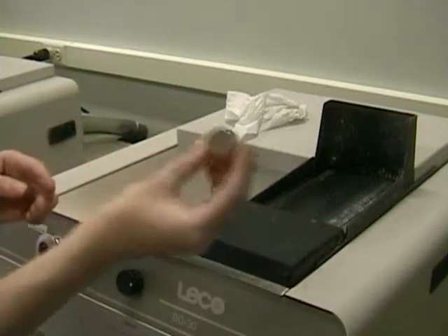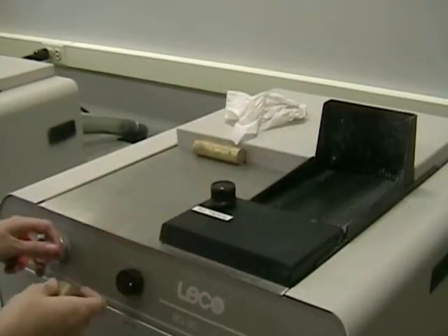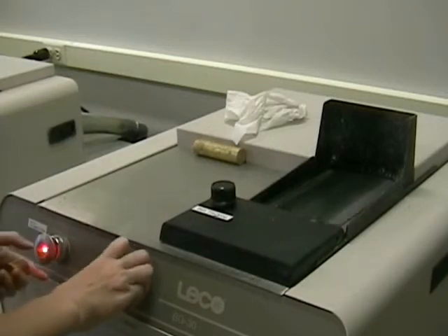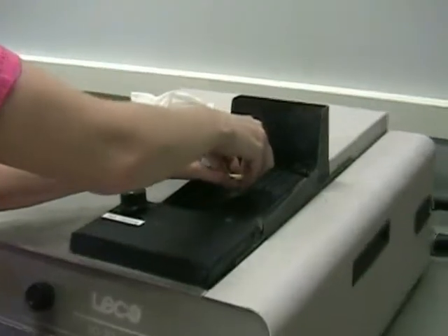Grinding on a belt sander is done to flatten the sample and to remove sharp edges and large scratches caused by the saw. Here's the sample we just cut. Start by turning on the machine and the coolant water, increasing the flow, and then place the sample on the belt sander.